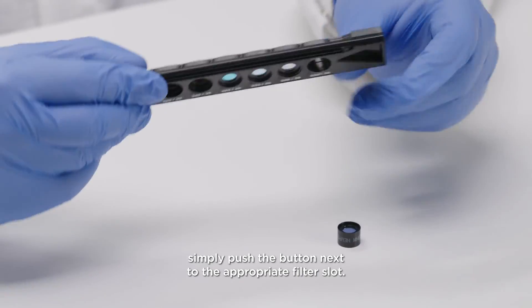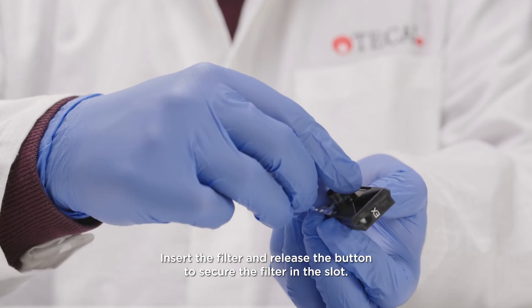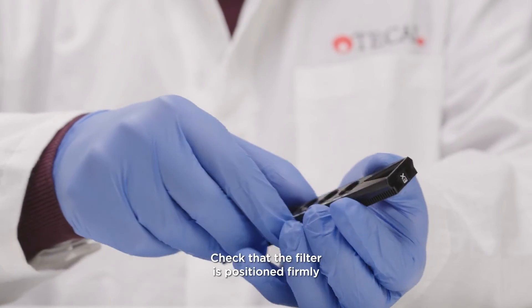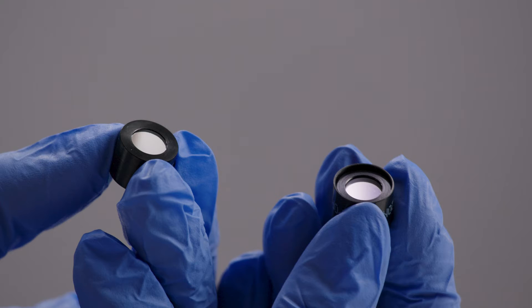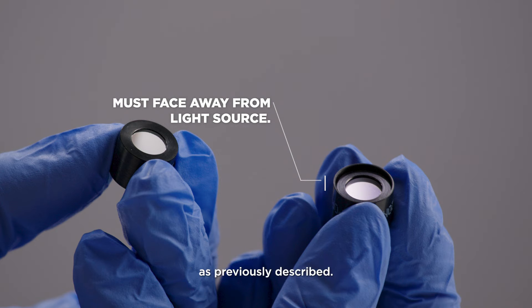To install a filter, simply push the button next to the appropriate filter slot. Insert the filter and release the button to secure the filter in the slot. Check that the filter is positioned firmly and flush with the bottom of the filter slot. Make sure that the filters are inserted in the correct direction as previously described.